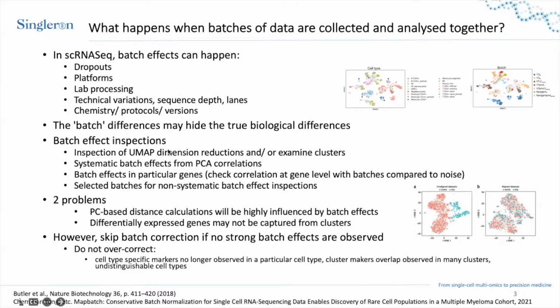I believe we have all heard from Shijing's 3rd webinar, where she talked about the standard analysis pipelines. One part of the standard analysis is the UMAP reduction, where reduced dimensions are generated and principal components analysis is calculated from single cell experiments, and the clusters are calculated based on these reduced dimensions.